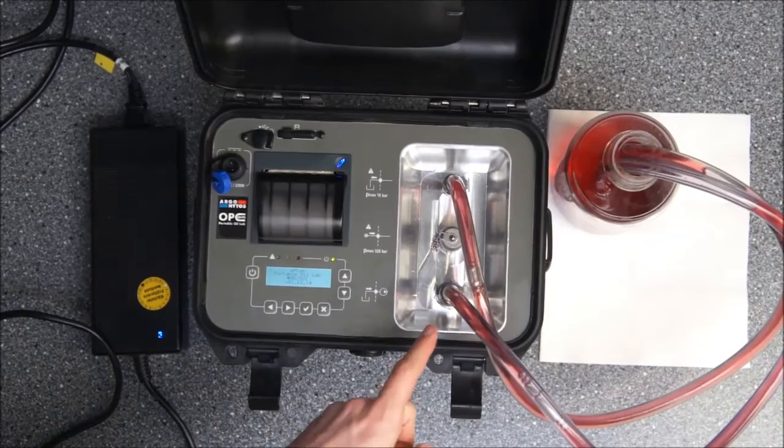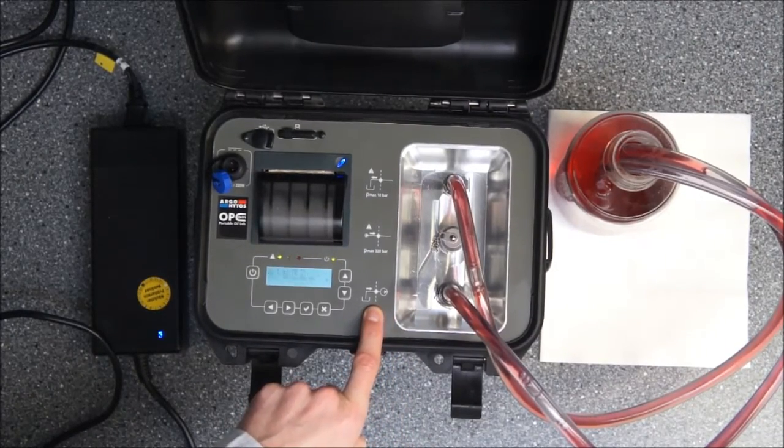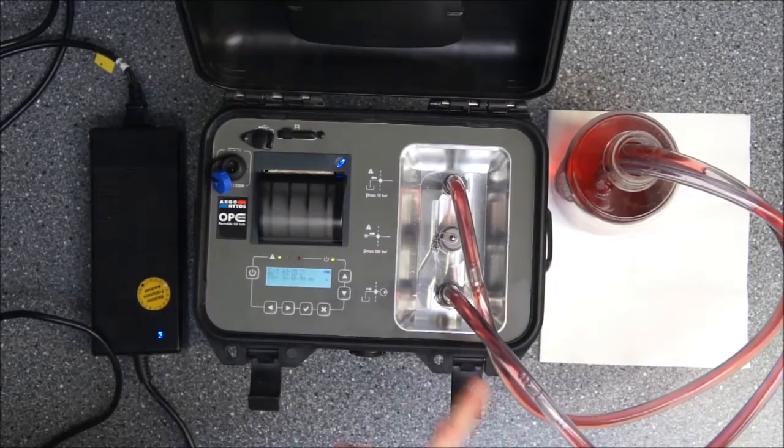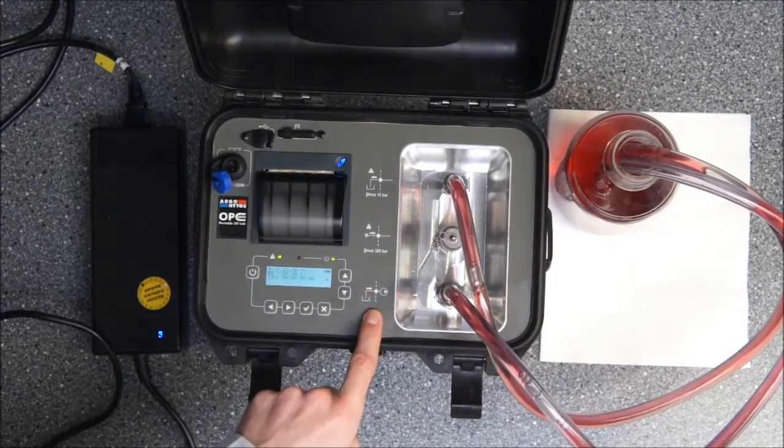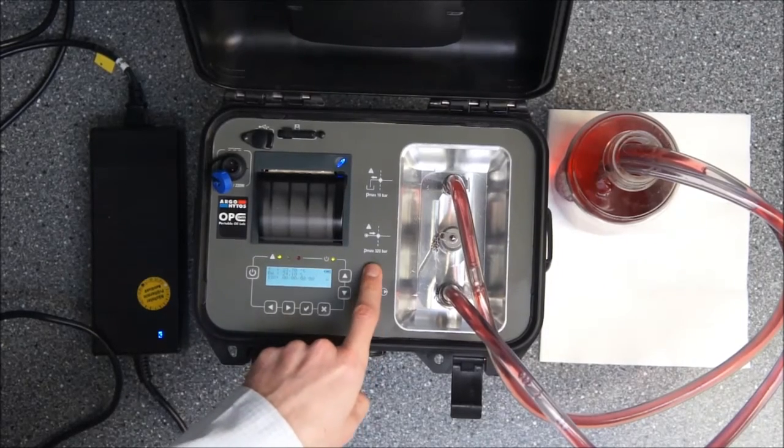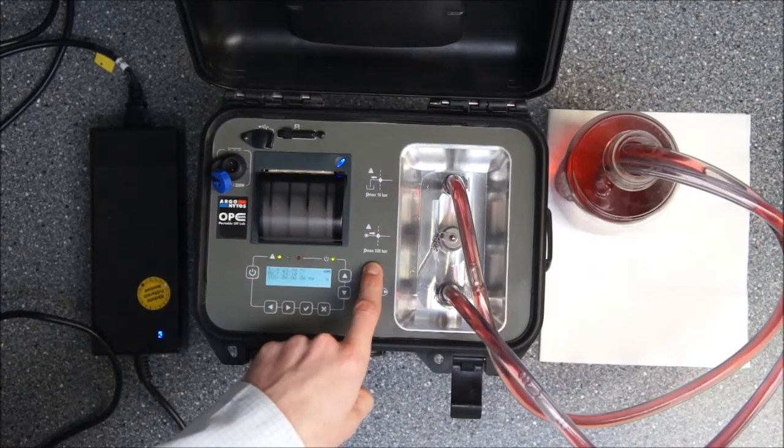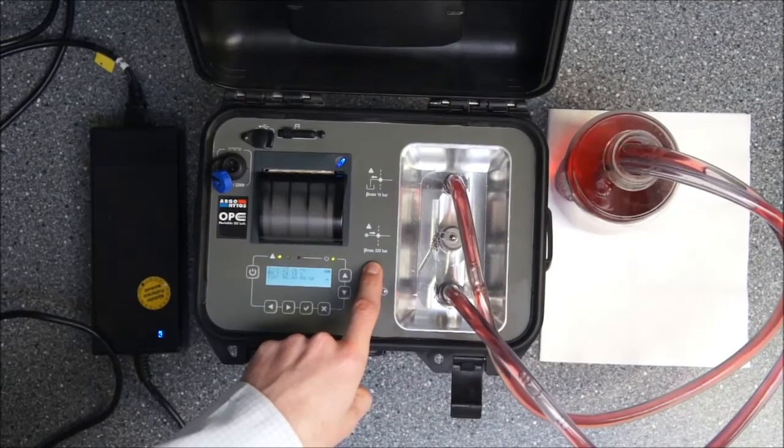On the right side you see the hydraulic connections starting with the suction port. There is an internal pump in the unit that is just sucking the oil from a reservoir or in our case an oil glass sample. In the middle you see the pressure port which can directly take a sample from a pressure line up to 320 bar.